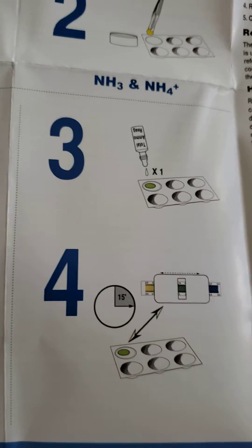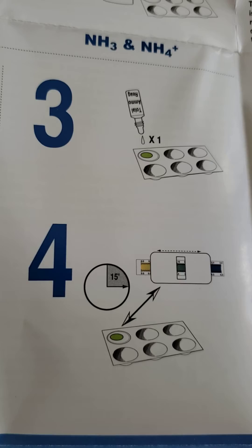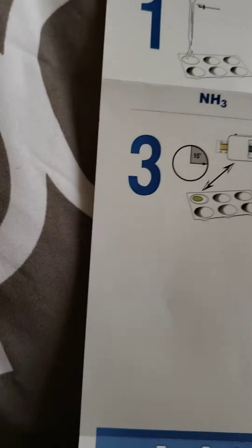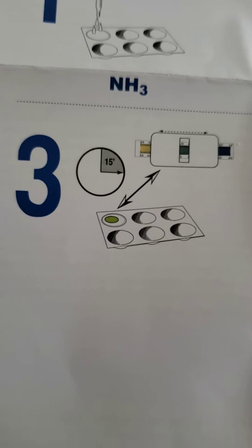Slots three and four are if you want to test for total ammonia — you have to add that solution. I'm not doing that one. So it's basically just wait 15 minutes to see if it changes color.